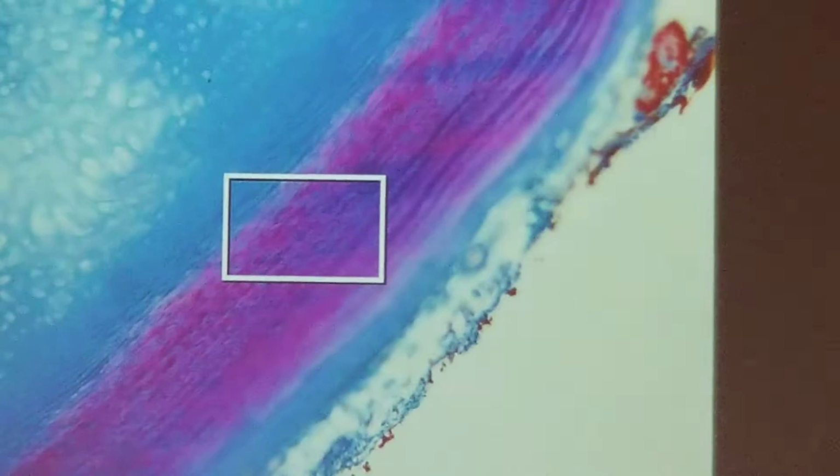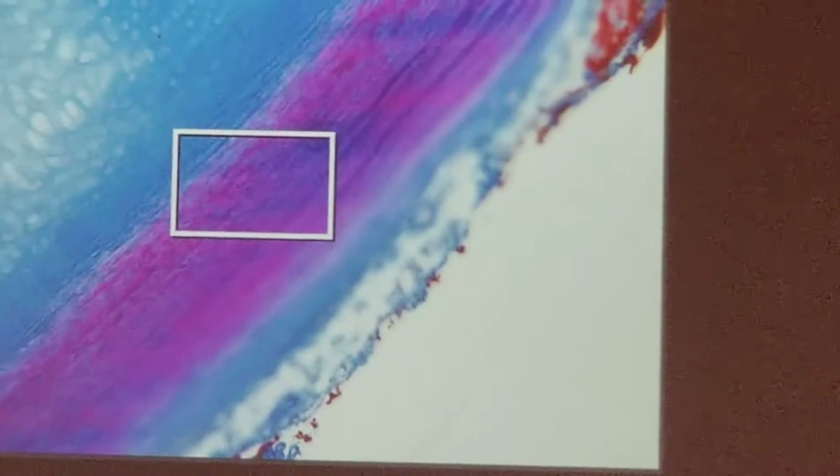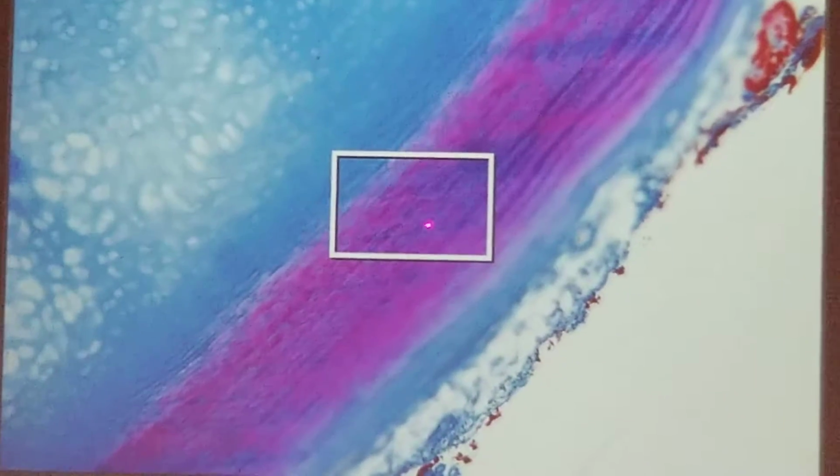The biggest thing with this is just being able to recognize, because of the color, that it's the fibrocartilage. What's going to be really hard, almost impossible to see, you have to look really closely, and you can see them on your microscope, all right? You can actually see the chondrocytes in the lacunae. You're not going to see big open bubbles like we saw in the other type of cartilage, but you can see them basically here. That's about as best I can get it.